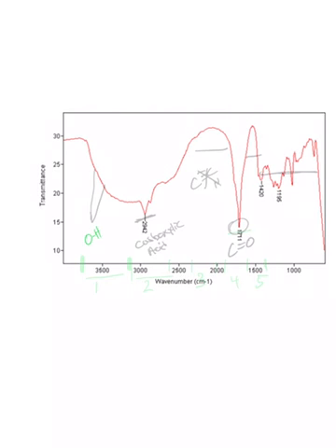We see that we have a carbon double bonded to an O. And so these two functional groups give pretty strong evidence that we could have a carboxylic acid in our structure. So that looks something like this. And we did see a sharp peak here, so there's a very, very high possibility.